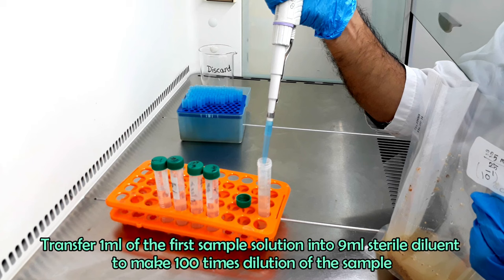Vortex the second dilution. Transfer 1 ml of the second dilution into another 9 ml sterile diluent to make 1000 times dilution of the sample. This dilution is called 10 inverse 3. Vortex this third dilution.